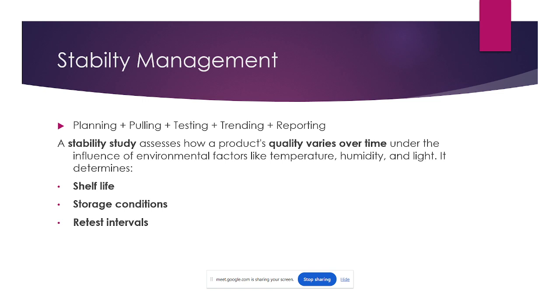Okay, and then coming to the stability management, stability management is a huge topic. And this is very important. Why? Because stability study is required for pharma products. It checks the shelf life, the product expiry, and the product stability is also checked under different conditions, different storage conditions and different intervals. So based upon that, the stability management module will be useful in the LIMS.